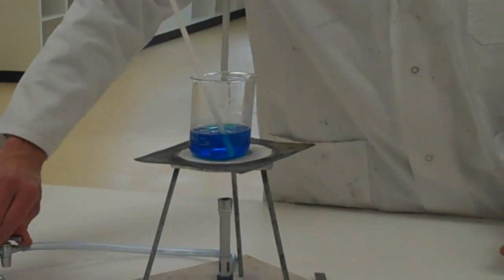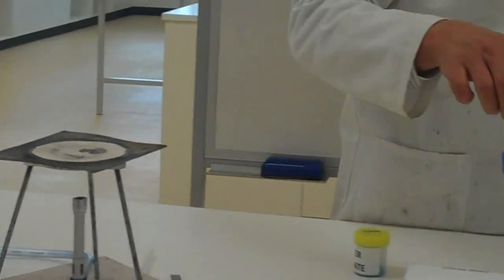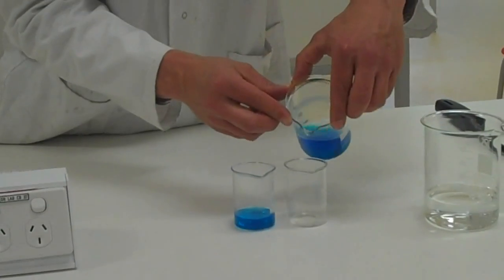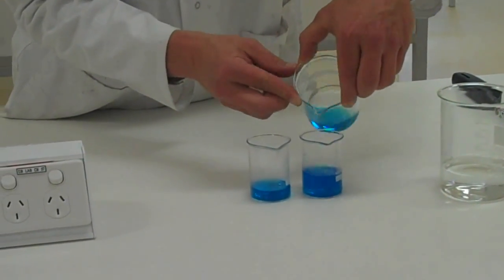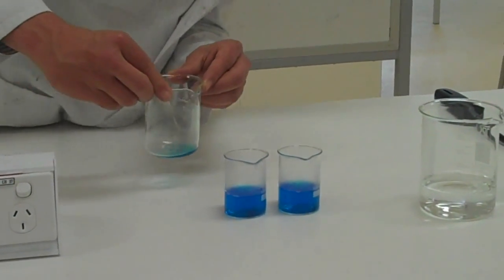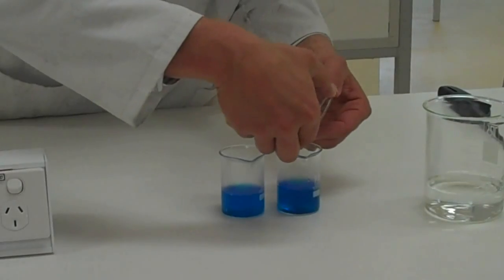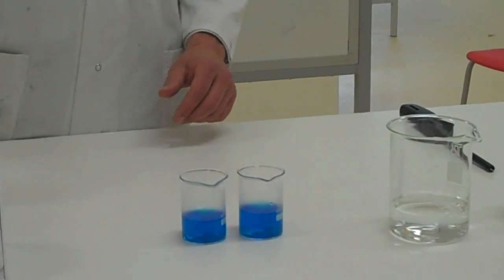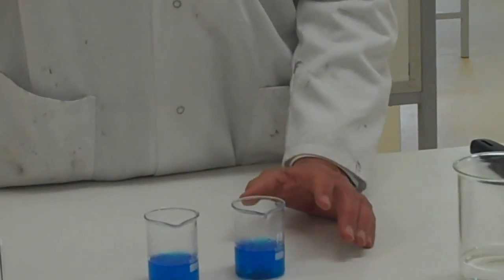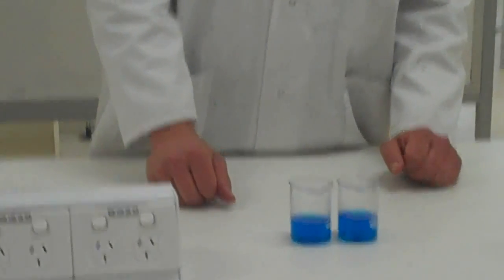I'm going to turn off the Bunsen burner. What I'm going to do with this solution now is pour half into each of these smaller beakers. It is important that we get this right — if we're making this a 100% fair test, we'd make sure they are spot on the same. So what we have are two smaller beakers, both with the same solution from the same beaker, with exactly the same amount of copper sulfate, because I just halved it up. The volumes are pretty much the same, which is important.